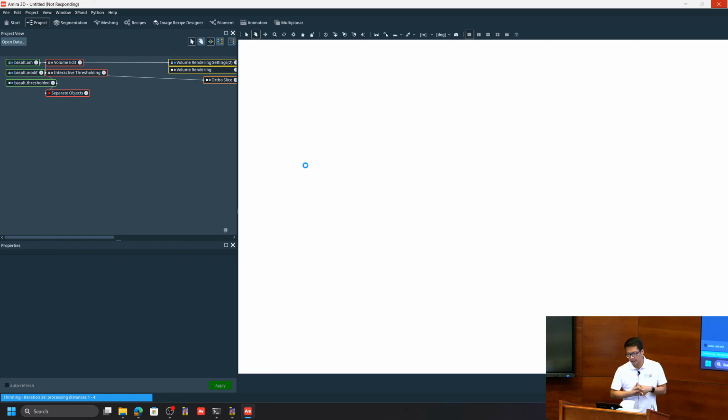So for people in Antwerp, this is a pretty common type of data where they have rock samples or soil or some geological sample, and they have a core sample of it, and they do a CT scan, right? So they do a scan, and a very common analysis for them is pore space analysis, right? So they want to see the pores inside the rocks, because the pores is where the fluids flow, right? Like oil and water and gas, for example, and they're interested in this type of flow, okay?